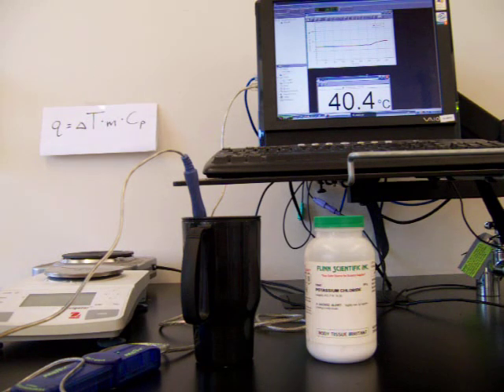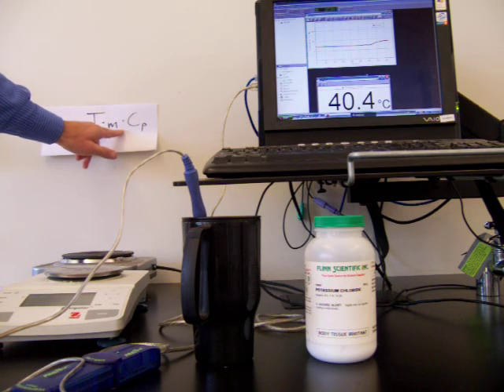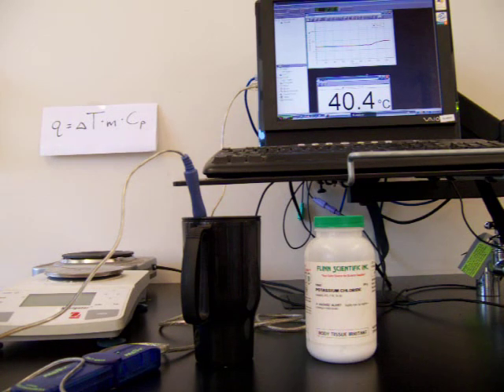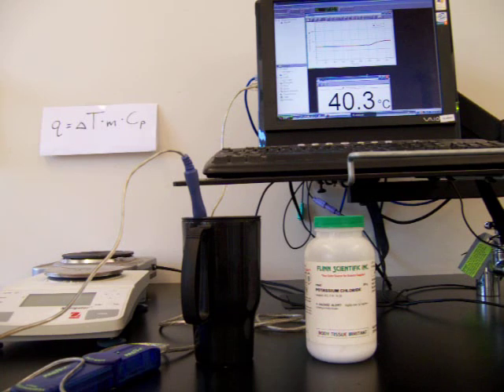You can use the final temperature and the initial temperature to find the temperature change. We know the mass of water was 75 grams and the specific heat of water is 4.184 joules per gram degree Celsius. Using the equation Q = ΔT × mass × specific heat, you can figure out how much heat the sodium hydroxide released — all that heat was absorbed by the water. You can then divide by the mass of sodium hydroxide and convert to moles to get kilojoules per mole. This is an exothermic reaction.